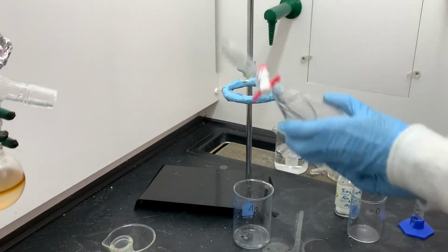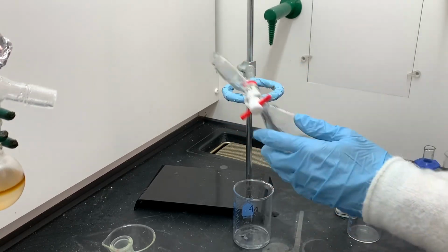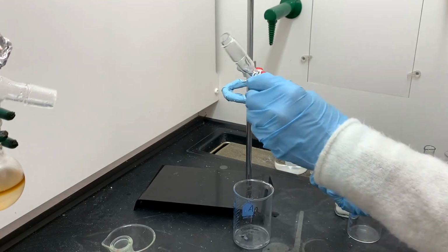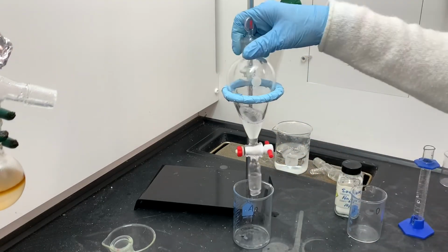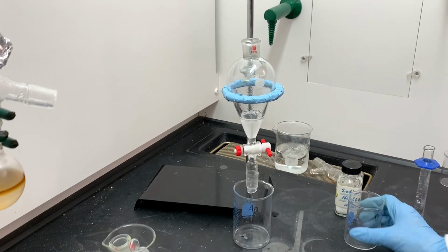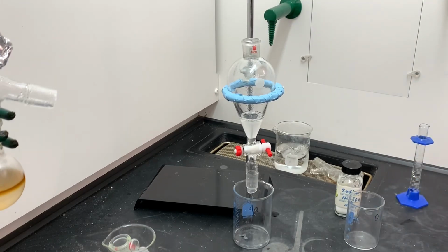Second time, just to verify that everything has been removed. It's pretty normal to do this technique 2 times, just to make sure that everything is getting taken out. And again, the saturated sodium chloride is down on the bottom, our product is on the top, nice and clear. Once those bubbles all get broken up, then I'm going to drain the bottom layer again.